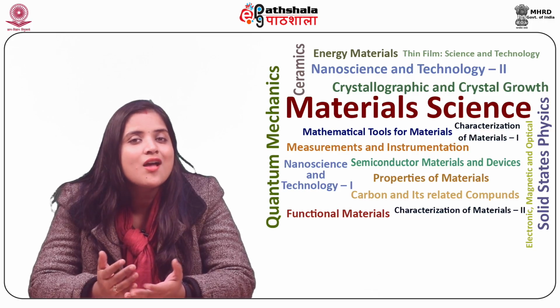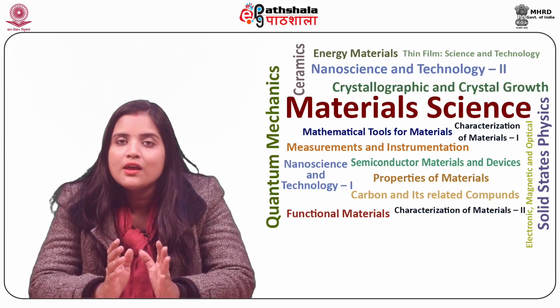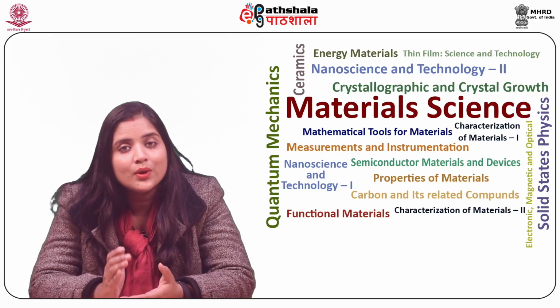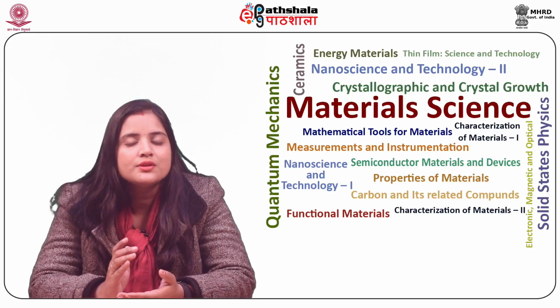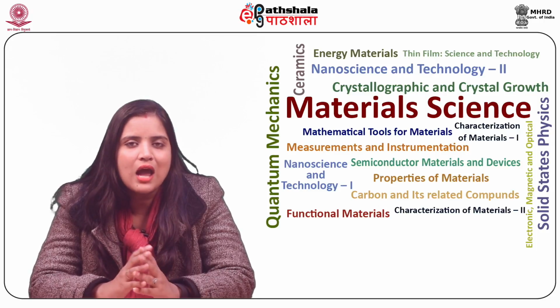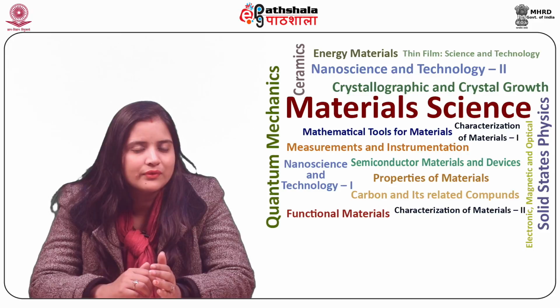Let us discuss the strengths of electron probe microanalyzer. A great similarity is there in between scanning electron microscopy and electron microprobe. However, the only difference is that electron probe is provided with a variety of crystal spectrometers which allow chemical analysis quantitatively, that is WDS, with high sensitivity.